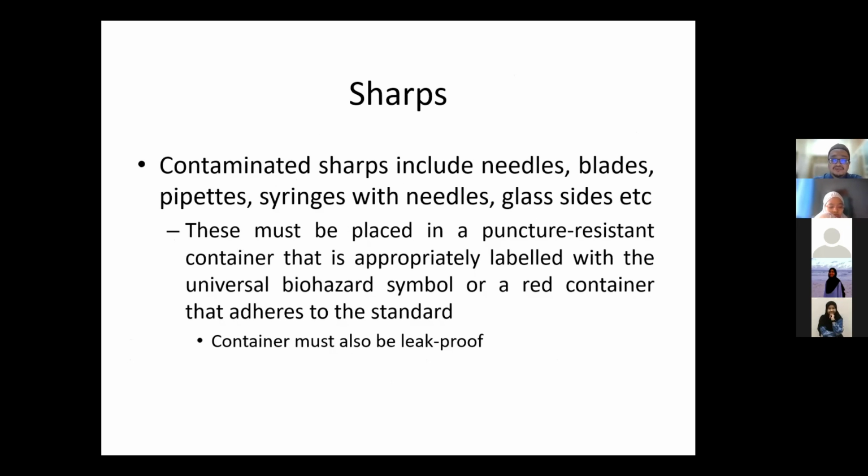Okay. Sharps. What are the sharps that we could find in our lab? It could be needles, it could be blades, pipettes, glass pipettes that are broken, syringes with needles, glass slide. Nanti nak buat smear, we break some of the slides, bukan glass slide and glass slides. Then it is considered a sharp. If they are contaminated, we have used it for and already exposed to samples.